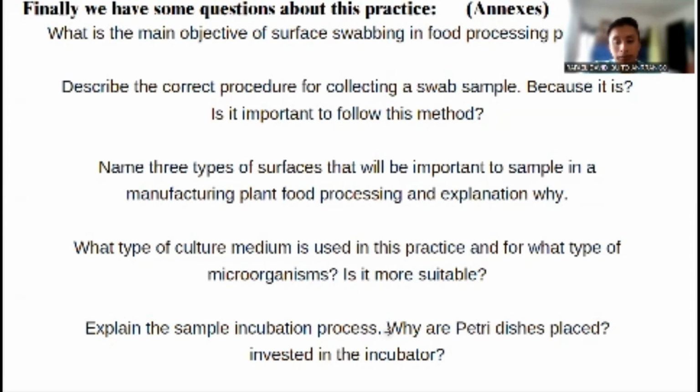A selection of isolates is then placed in a medium where they can be transported without danger or contamination to the laboratory.